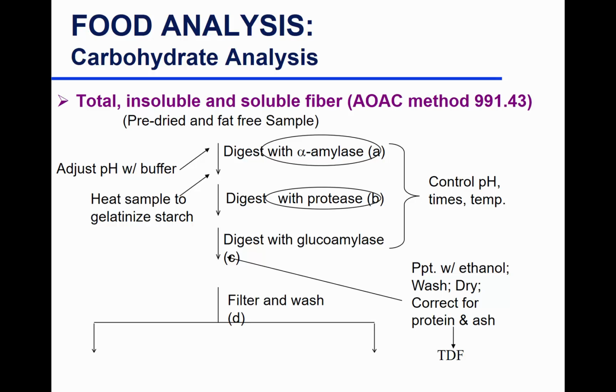Okay. So basically, you want to digest everything but your fiber. So you start with a sample that's been homogenized, pre-dried, fat-free, and then you do digestion.